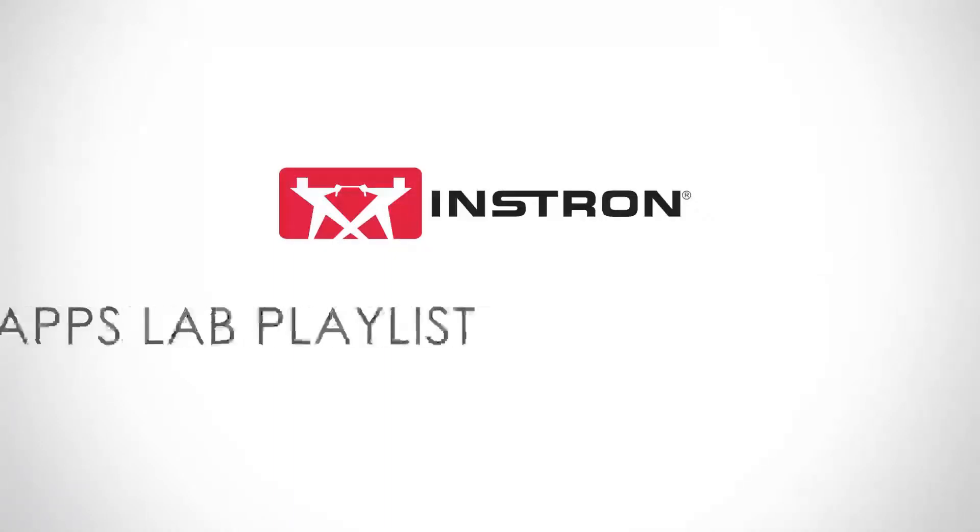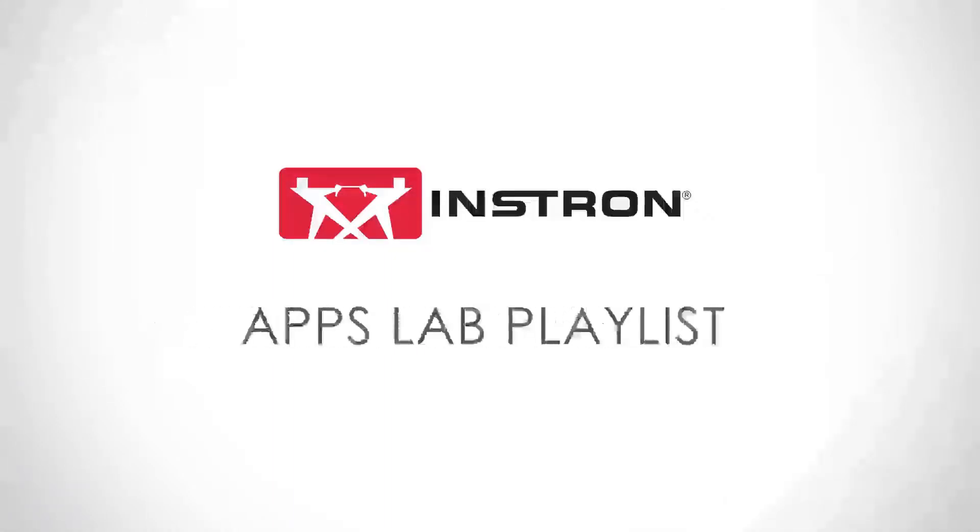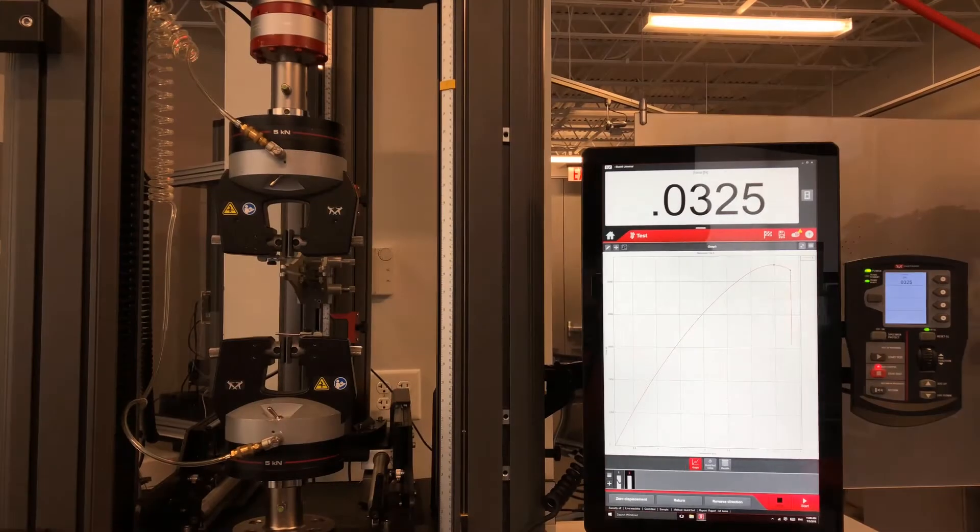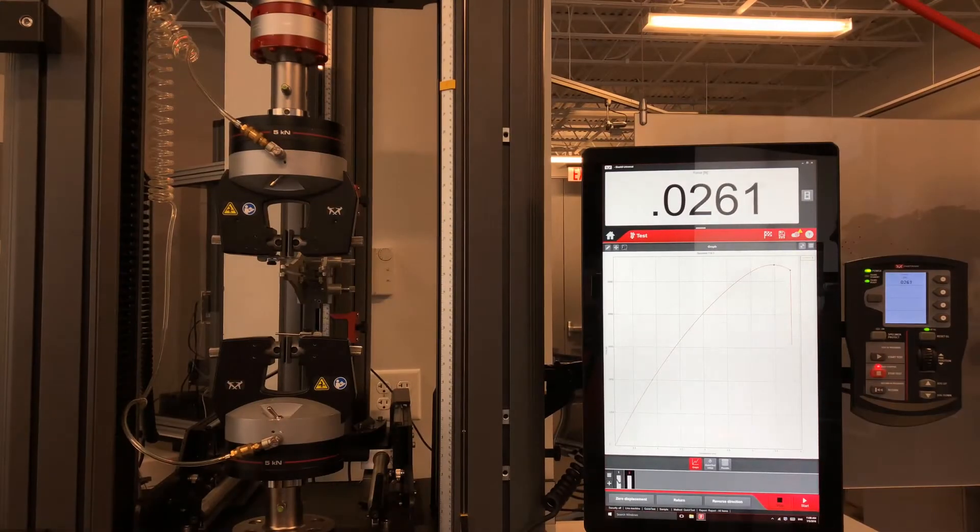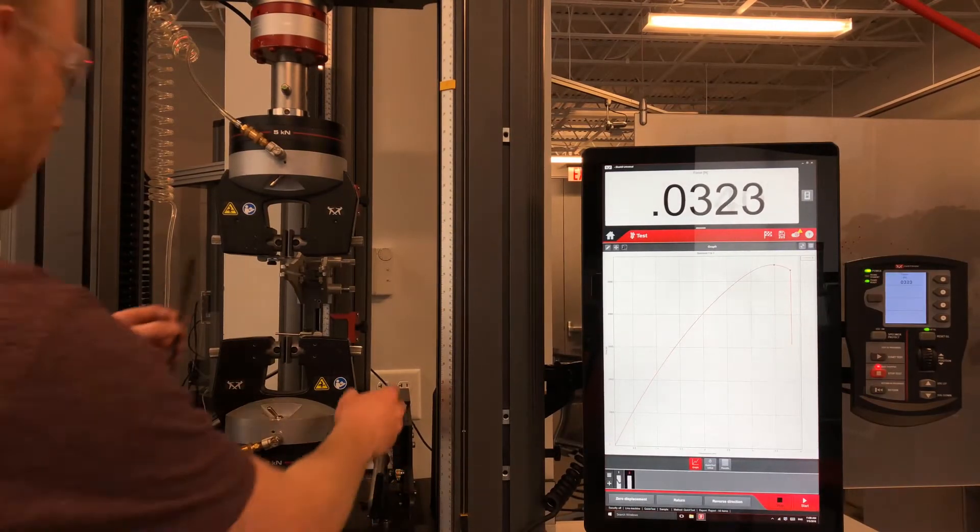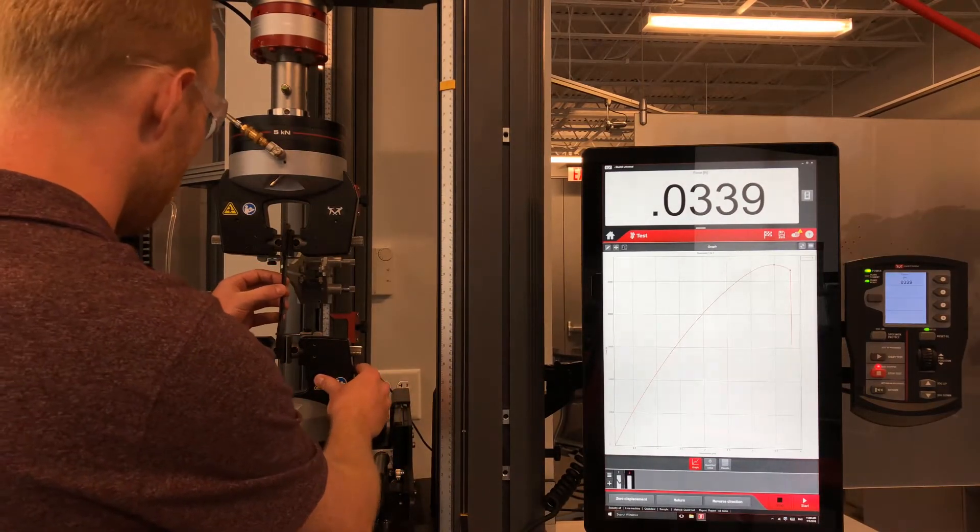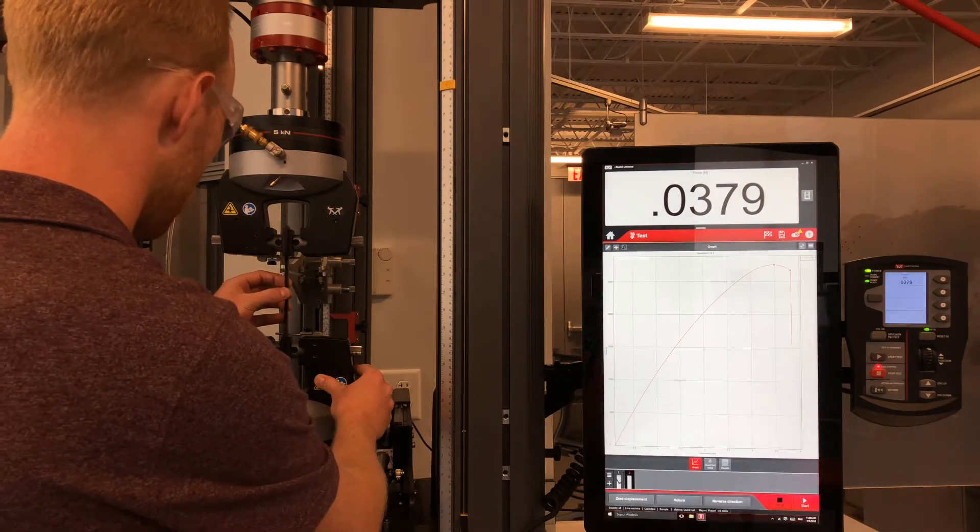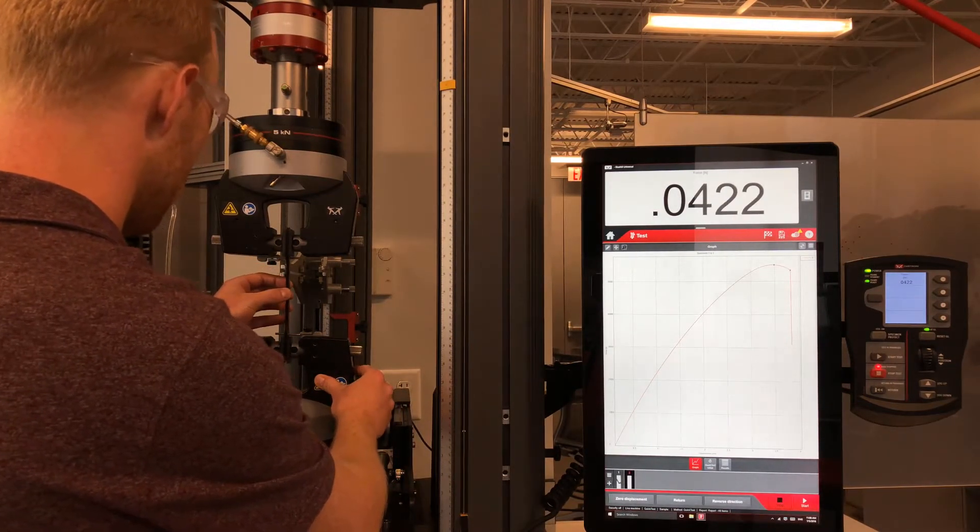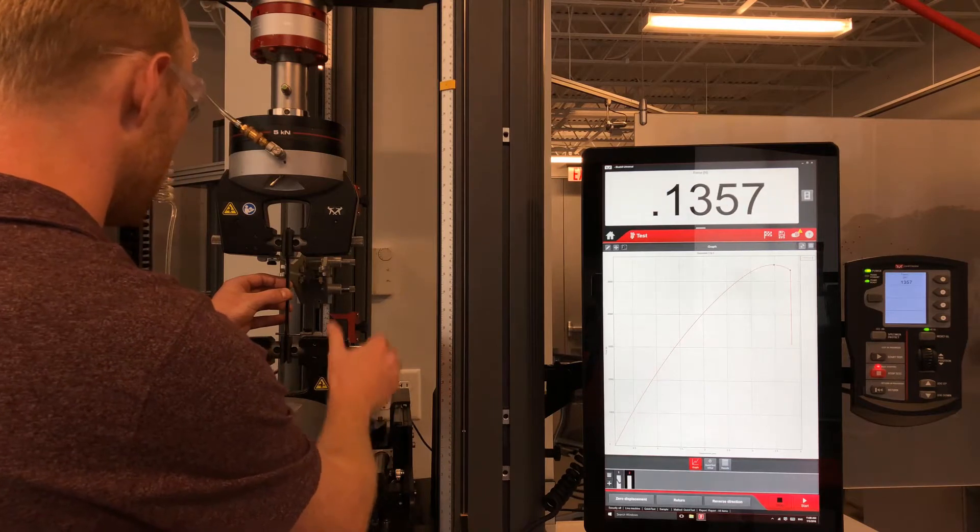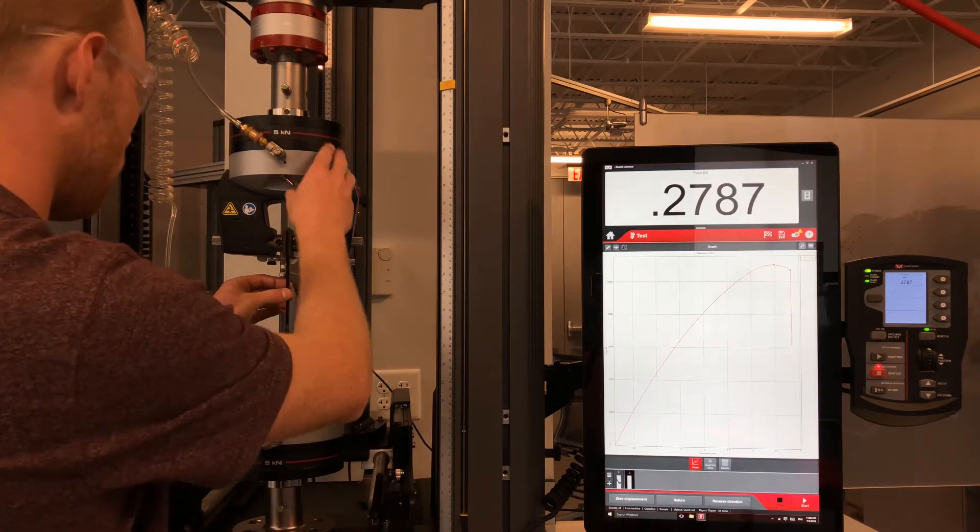Today we are going to talk about Specimen Protect, a feature available in all 5900 systems. Specimen Protect allows the user to remove unwanted tensile or compressive forces on their specimen prior to a test beginning.